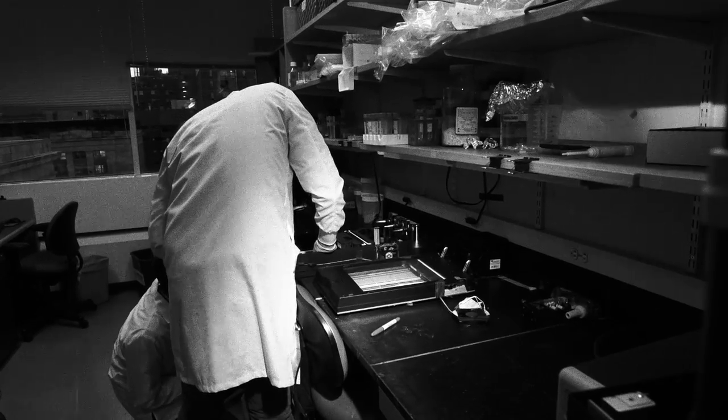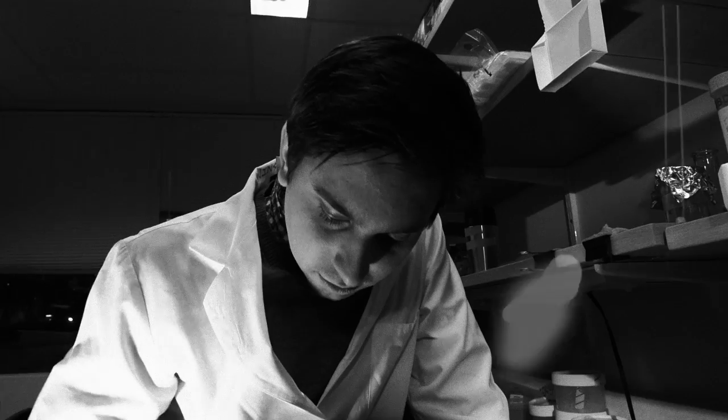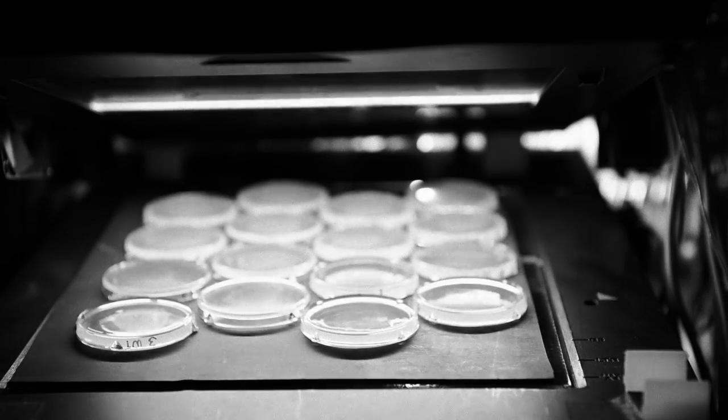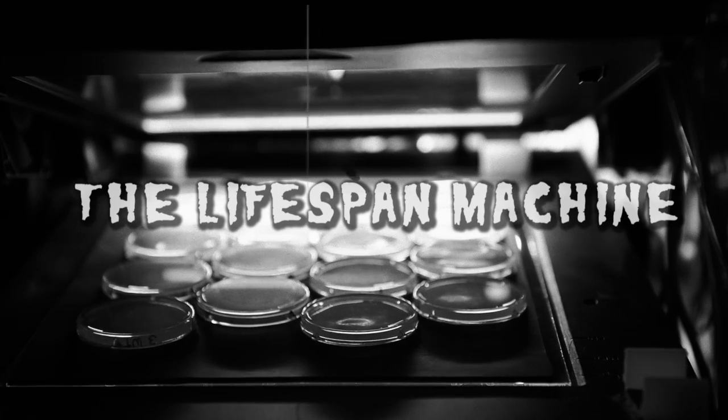From a dark corner of a university laboratory comes the device that reveals the mysteries of death: the Lifespan Machine.